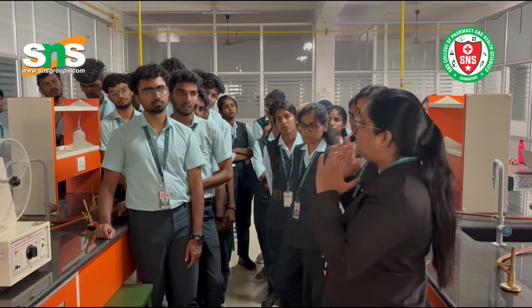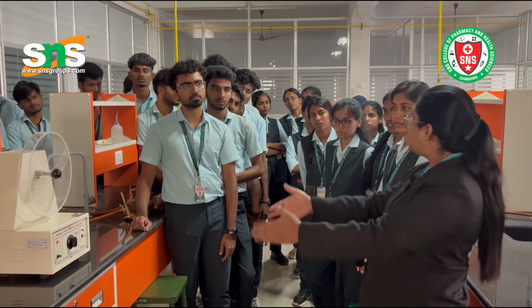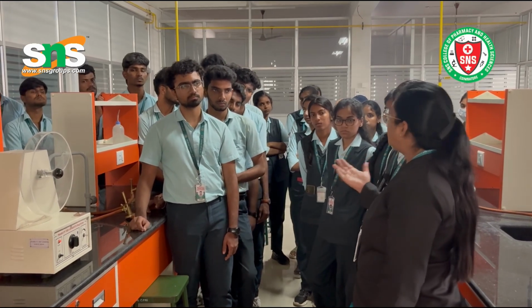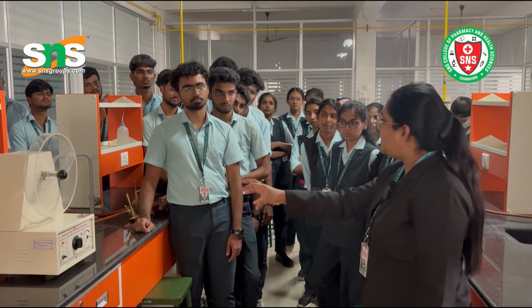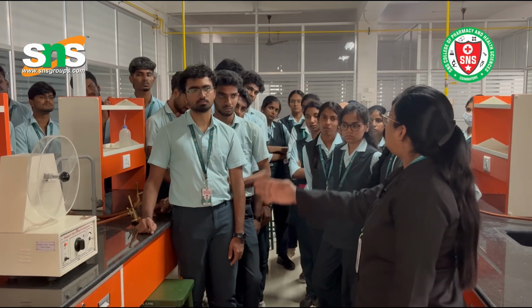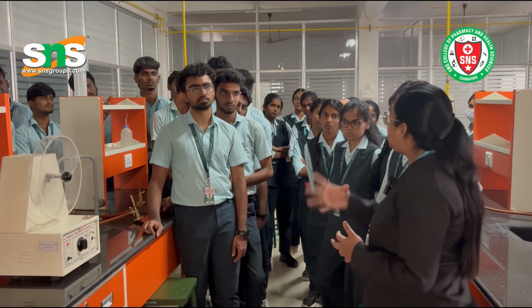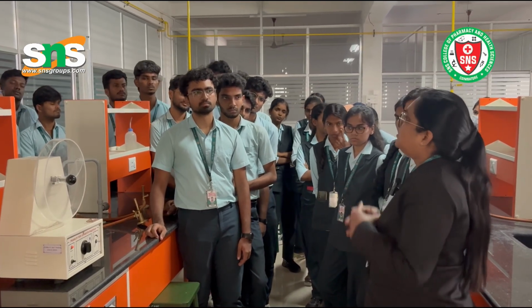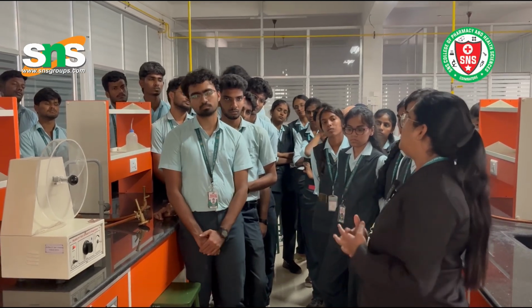So like that you have to think. This is the normal manual friability test apparatus. In the future, when you are going for a startup and thinking in design thinking mode, you incorporate a sensor and also some kind of cleaning brushes, and you put a standard operating procedure. The standard operating procedure includes cleaning every time. When it is cleaned properly, the next time it works properly. So like that you have to incorporate the DT things in every aspect of pharmaceutics.